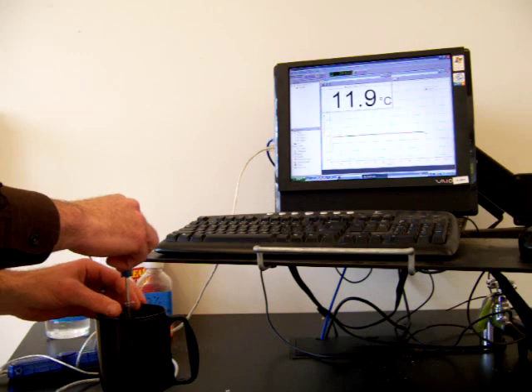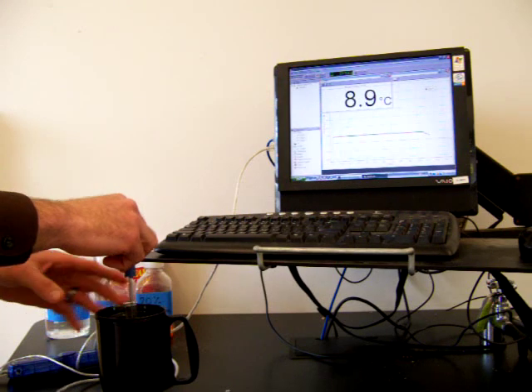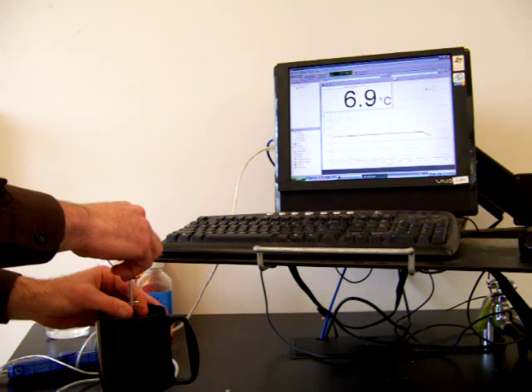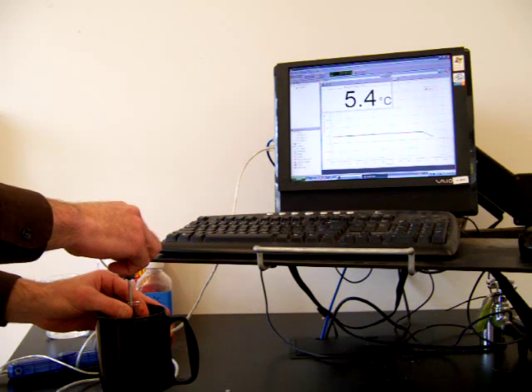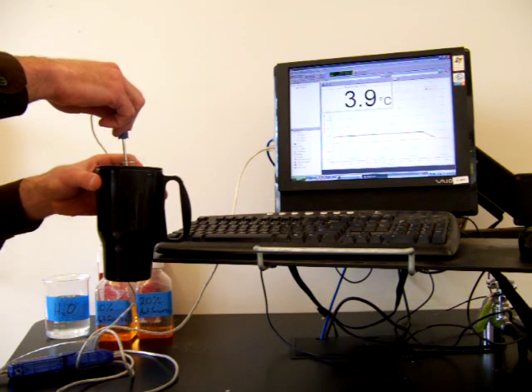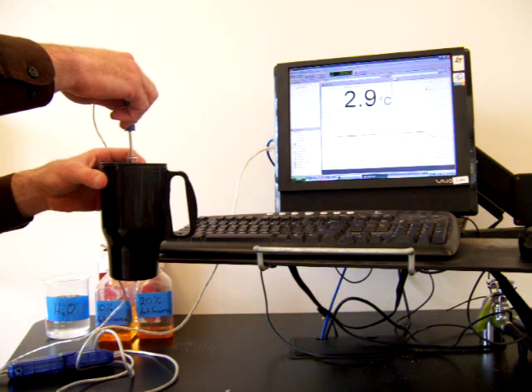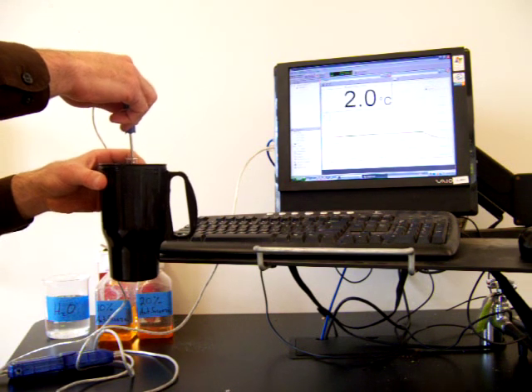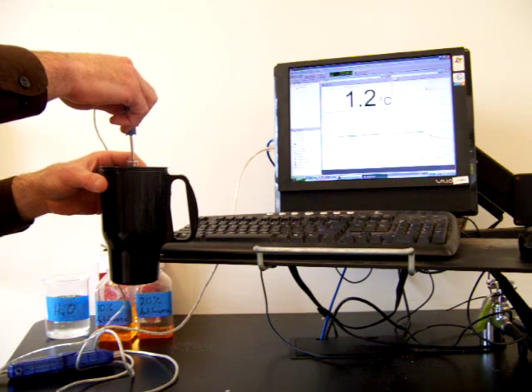The ice bath contains salt. And you can see the temperature dropping pretty rapidly now that it's in the ice bath. And I'm going to continue to stir this. And we're going to watch the temperature drop. And we're going to try to record the temperature when the water starts to freeze.